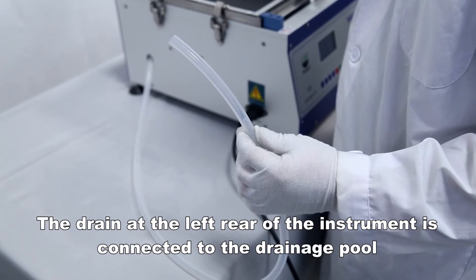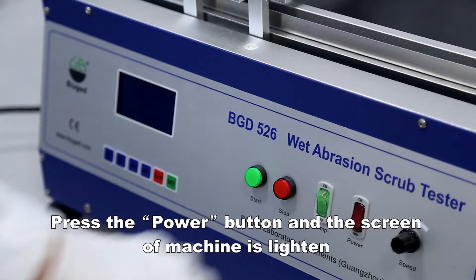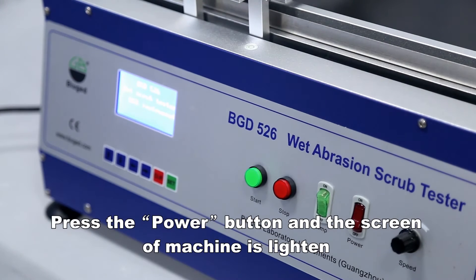Connect the drain at the left rear of the instrument to the drainage pool. Press the power button and the screen of the machine will light up.